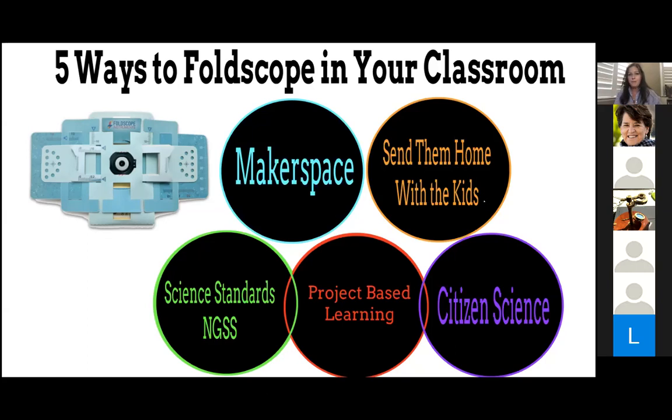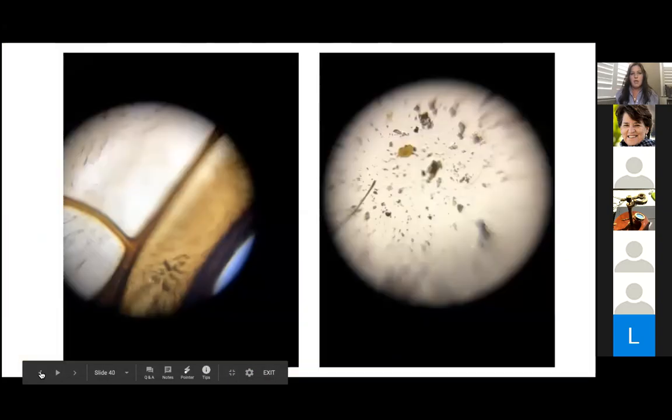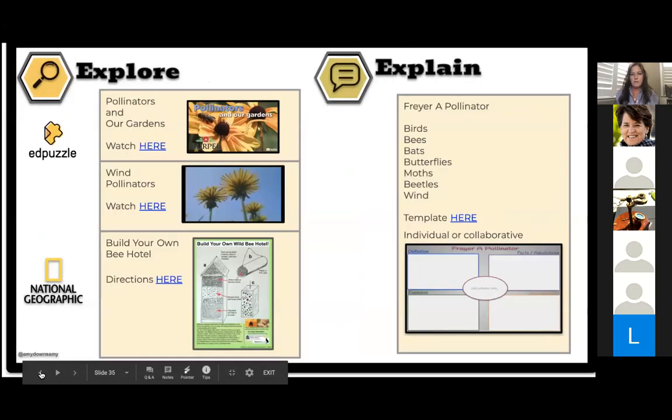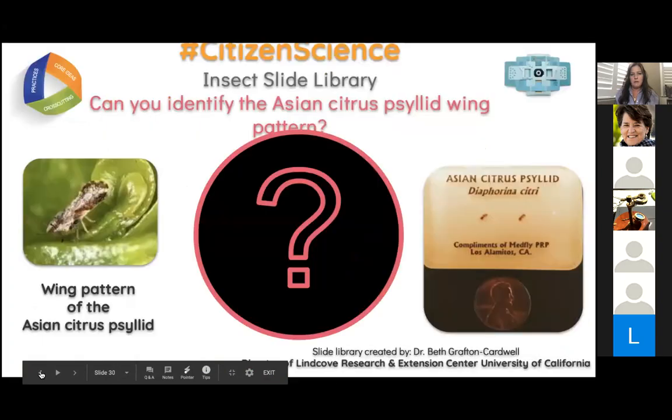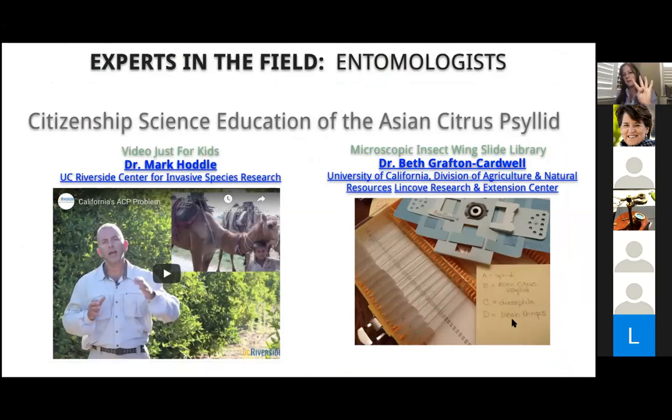But I think the question too was, when it finally does get to the student, how do they trap? Do they just create their own trap to get one in their own yard? No. Let me go back. I have, hang on one second. This picture right here, these are 4 microscopic slides, and they're prepared, that she prepares.